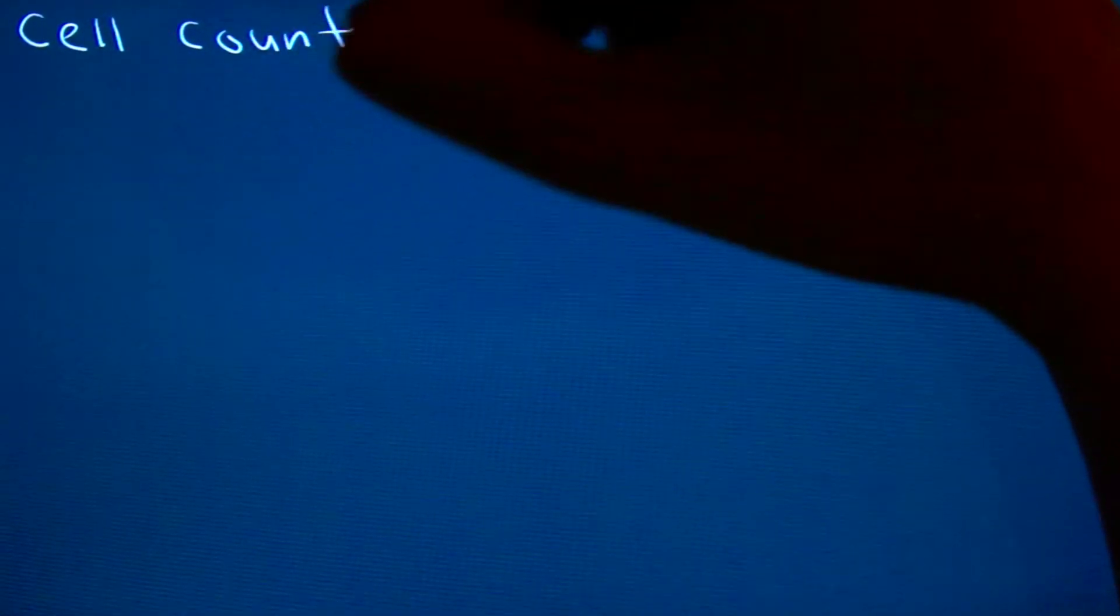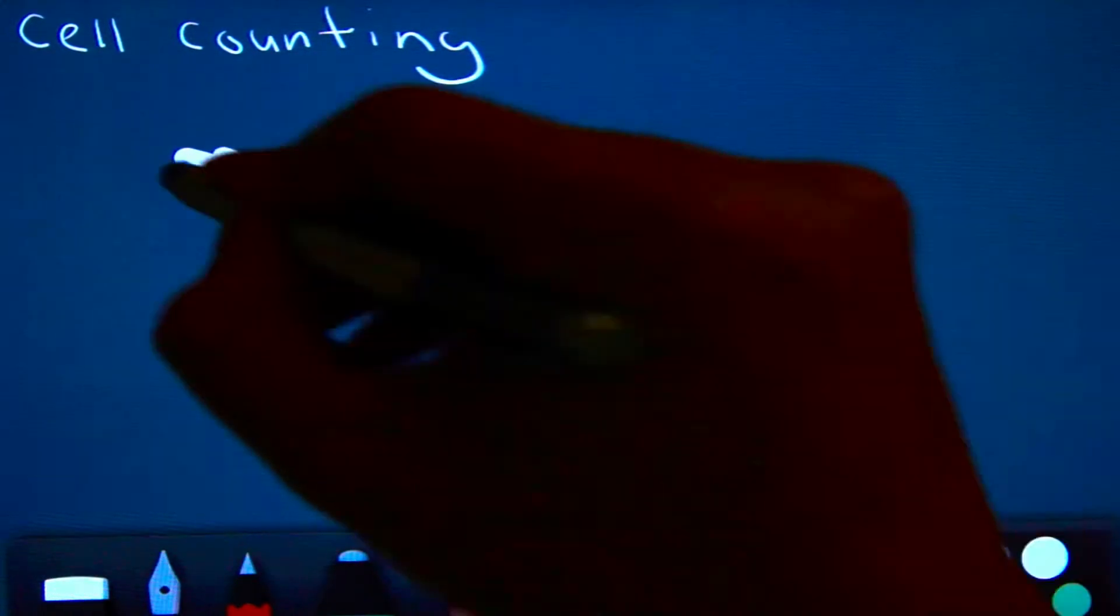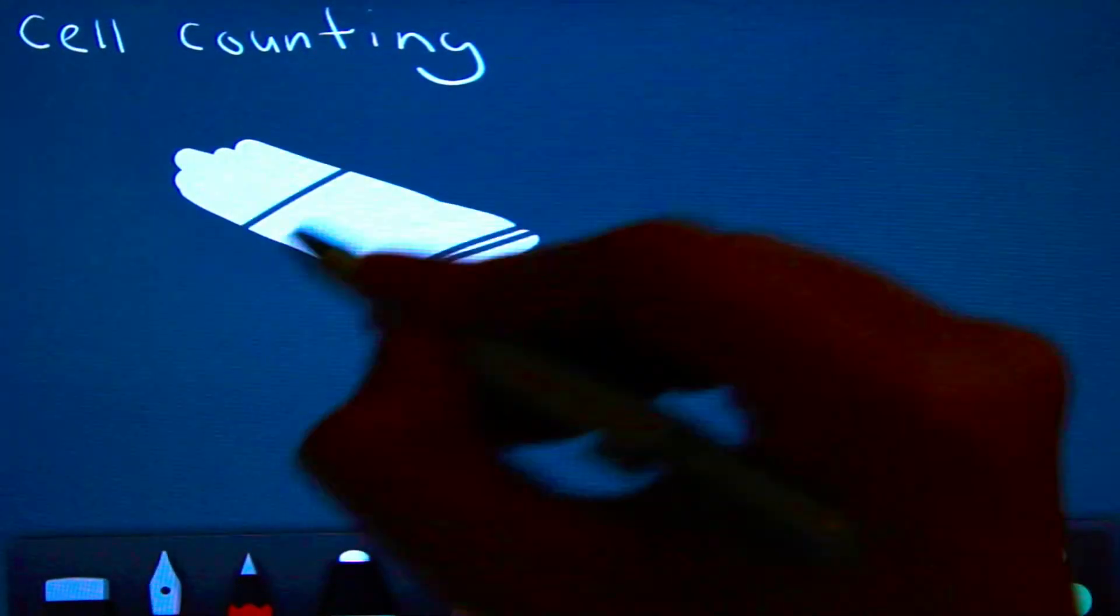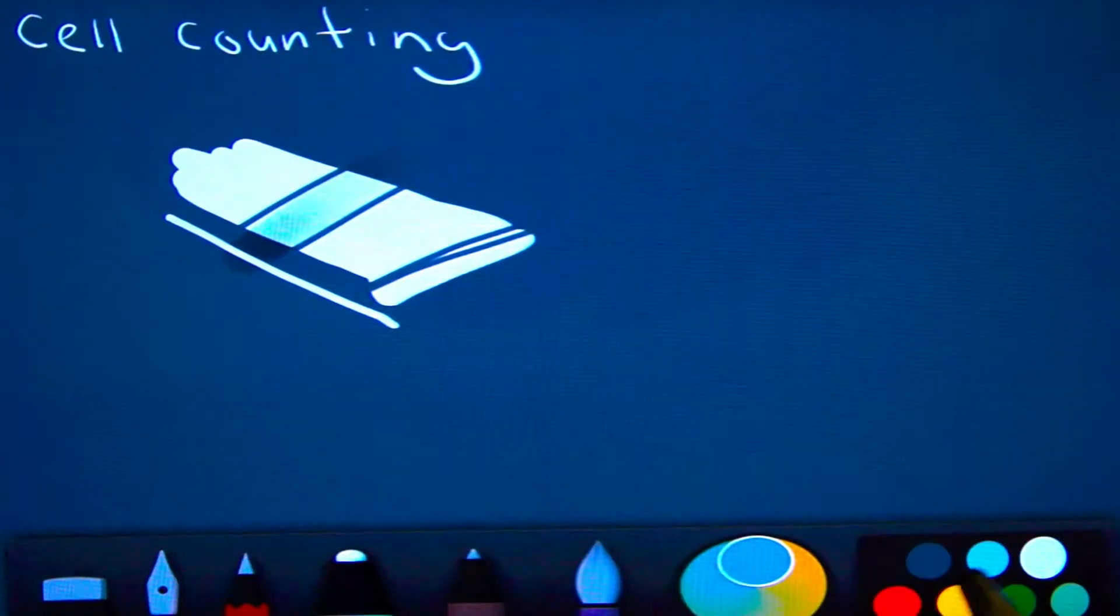Cell counting is a technique that is important in many procedures in biology and medicine. The hemocytometer is one such device that is used to count cells.